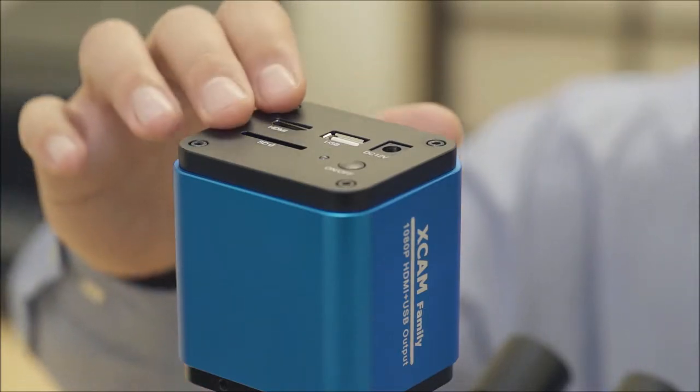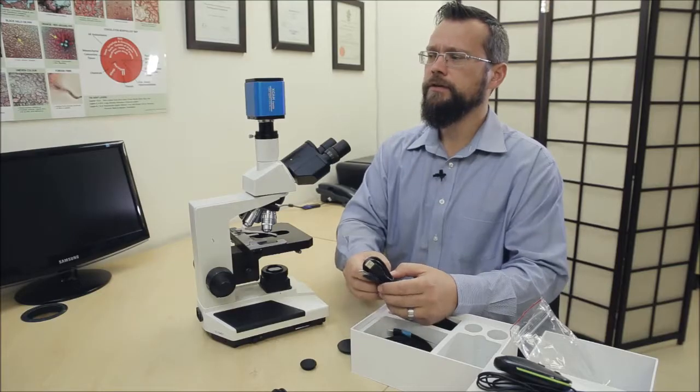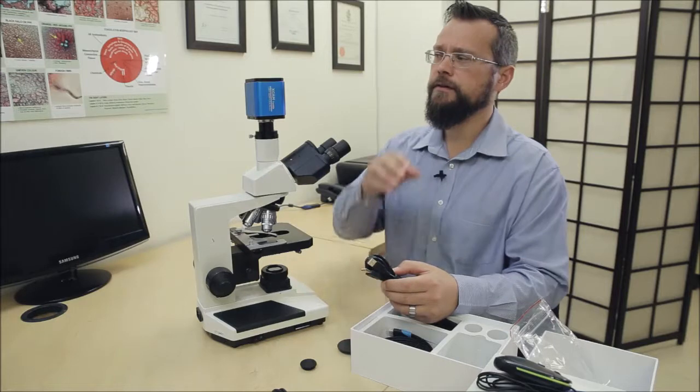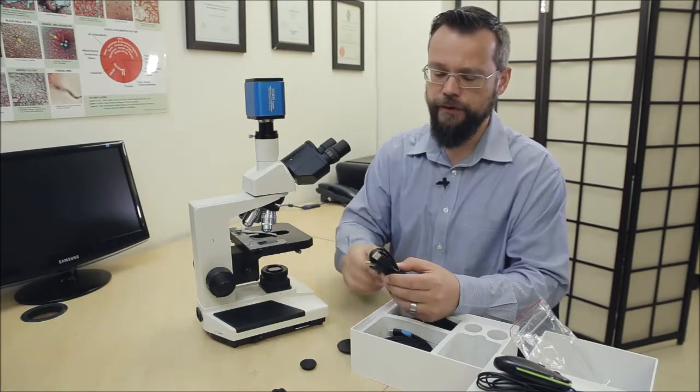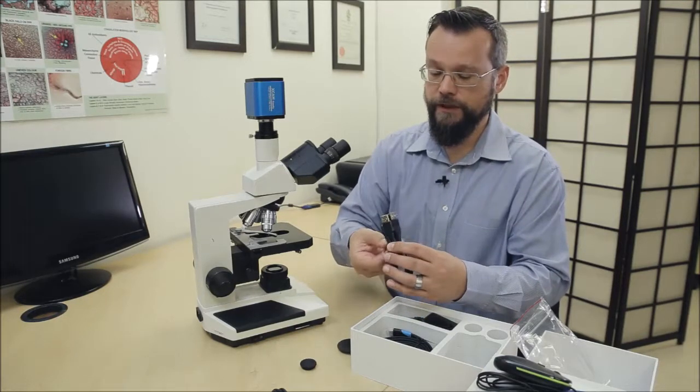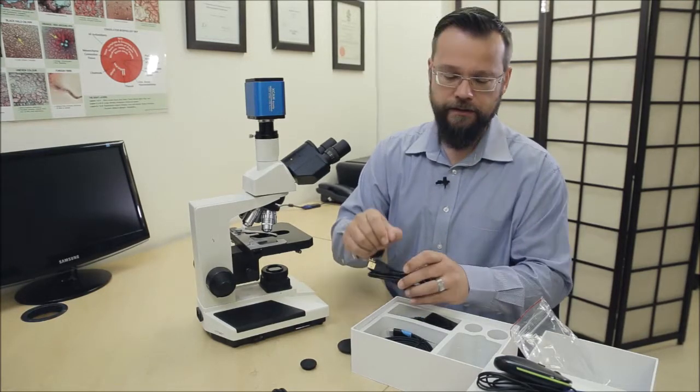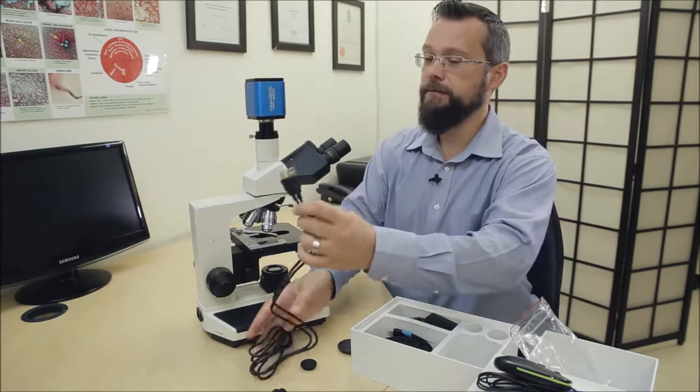So at the top of the camera you'll notice a few ports and a button there, so we're just going to connect everything there and we do supply instructions on how to connect the camera. There are a few options with the HDMI camera. You are able to connect it directly via HDMI cable to a screen without connecting it to a computer, but we generally recommend that you do connect it to a computer as well as an HDMI screen. The computer of course allows you to actually take images and save images of what you've seen in the blood.